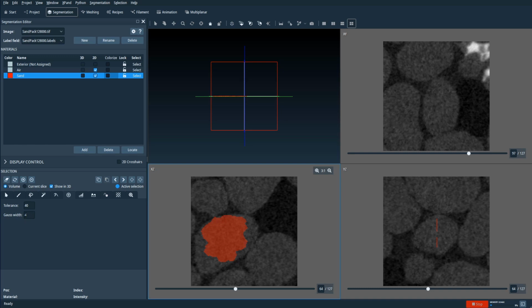But for this particular parameter here, you can set it to a low value of 1 and a maximum value of 8, with 8 giving you the most smoothing. You don't see it here, but the edges actually get smoothed out, and they slowly disappear with higher Gaussian width here. So you can see here that the region is growing even faster than before.